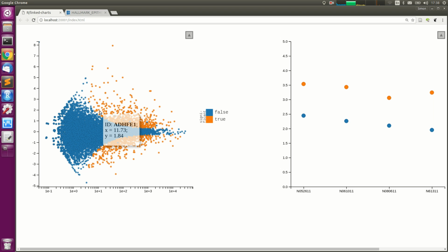The reason is, if you look at the counts axis at the bottom, the counts here are really low. These are genes which have an average of 1 read per sample. Here this is 10 reads per sample, which is really not much. So if we just happen to have 1 read in all the control samples and 3 reads in all the treated samples, we seem to have a 3-fold upregulation, and if it's 4 reads, then we get a much higher upregulation.